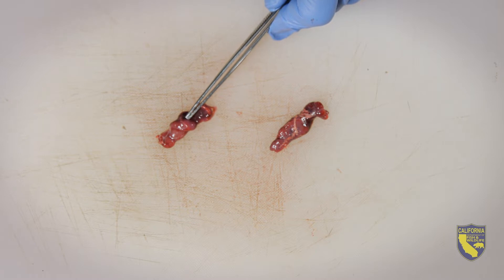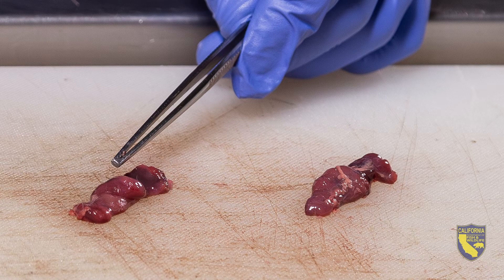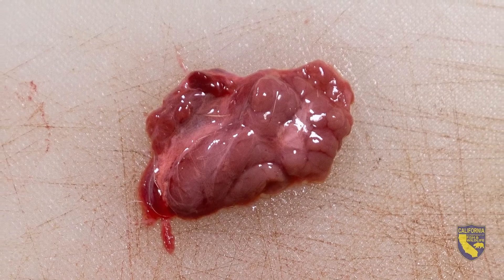These are the lymphoid follicles, and that's how you know it's a lymph node. If this were muscle, the color would be uniform throughout, and if it were salivary gland, it'd look like chewed bubblegum with multiple discrete lobules.